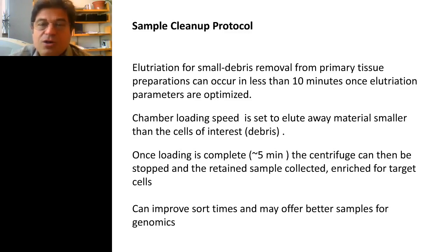The problem is the debris is all over the place in some of these preparations. So we saw centrifugal elutriation as a potential solution for cleaning up these types of samples as a first step before cell sorting. And in our lab, we've started to work on this, and basically what we're doing here is eluting away the small debris and retaining the cells in the elutriation chamber.